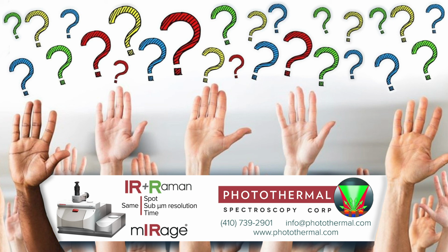It is possible to damage a biological sample using the laser, of course, and also using the X-ray beam. So this is definitely a possibility. Therefore, we used an experimental setup where we first use infrared spectroscopy, and then X-ray spectroscopy. If we use high laser power, we could also burn the sample.